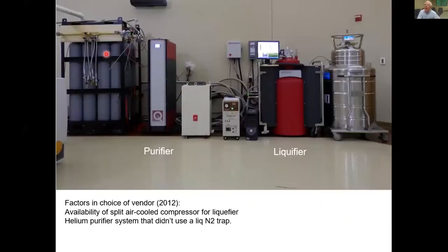It comes back in the lab, it goes into these high-pressure tanks, this rack. This is where we can connect up purchased helium gas tanks. It goes into the purifier, as has been talked about. This is the compressor for the purifier. It's an air-cooled unit. It's smaller than for the liquefier, and it's actually in the room. So the heat is dissipated in the room, and it's not a problem because, as in our case, it's a very big room. It goes to the liquefier, and then we have a 250-liter Dewar. We transfer into here. This is one with an electrical heater, so we don't have to worry about gas for pressurizing.